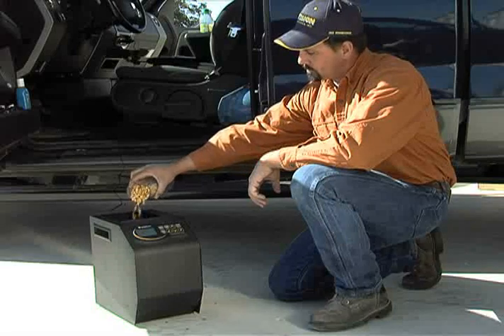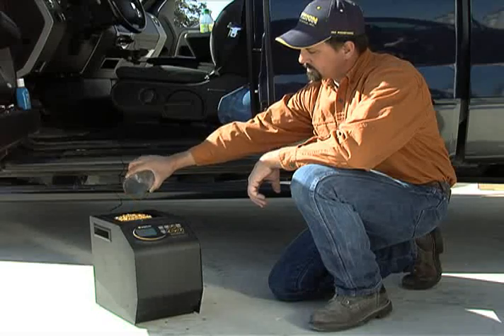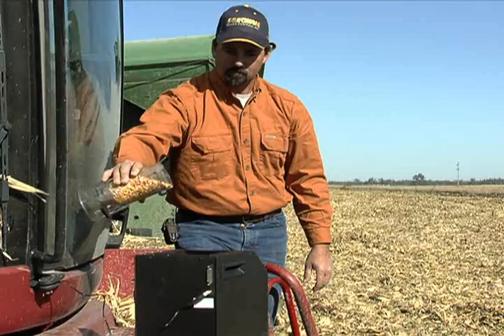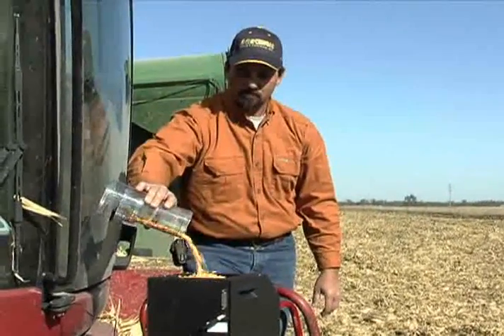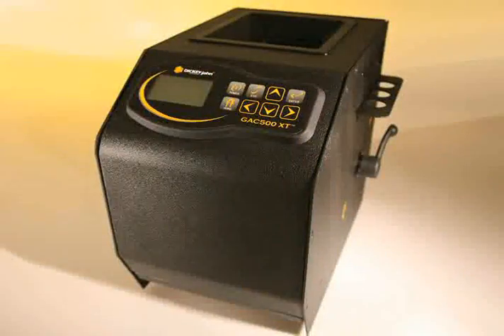But that's just one of the reasons Mark Becker uses the GAC 500 XT. I chose the GAC 500 XT because it's economical, and I like the fact that it gives me moisture testing as good as the elevator quality, and I like the fact that it gives me test weights. The GAC 500 XT is very portable — I can take it to a farm that doesn't have electricity and plug it into a cigarette lighter and take my moisture readings and test weight.